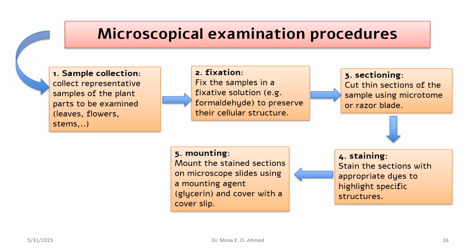For microscopical examination, there are several sequential steps or procedures that can be followed to determine the cellular content and the microstructure of a plant sample.